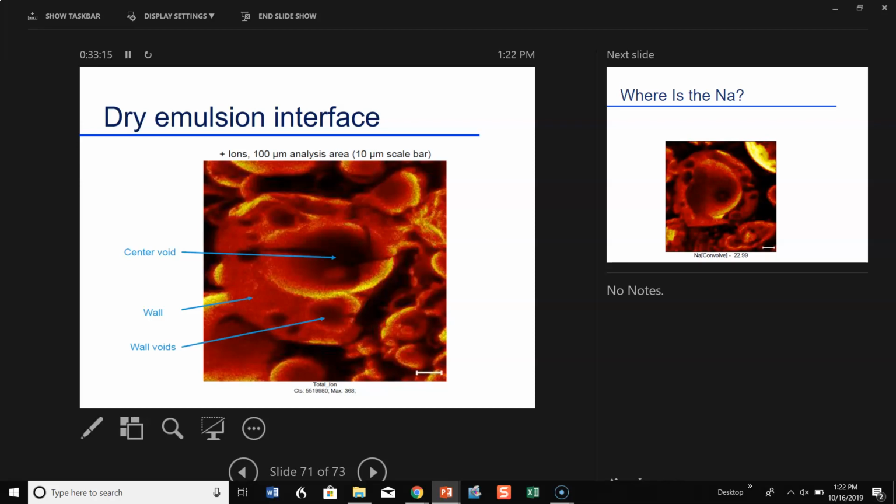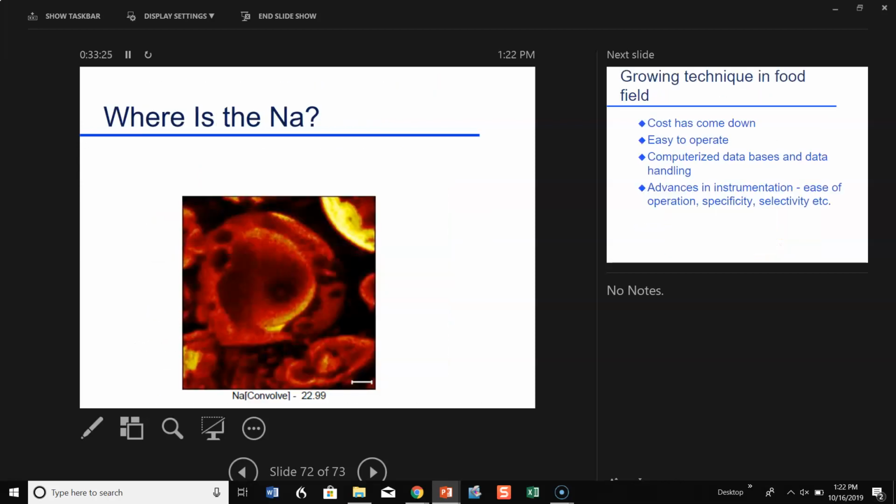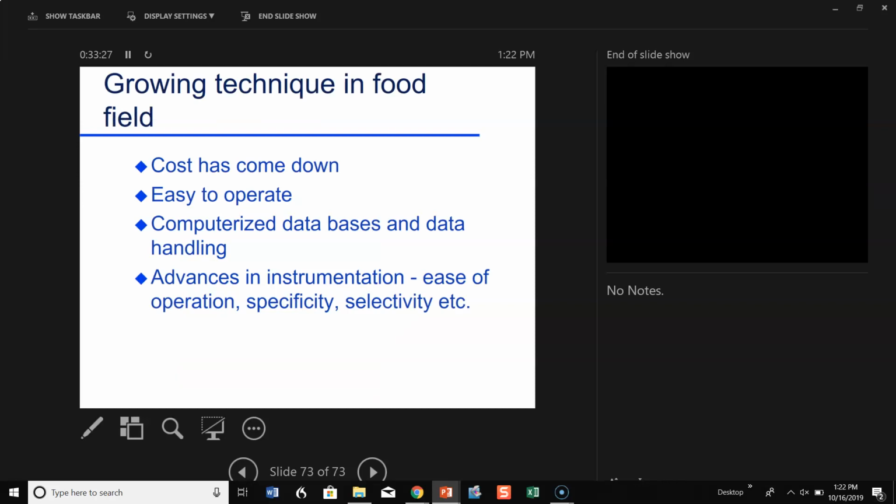So you can take an image of a particle as small as 30 microns and look how that particle changes, different structures of that particle. It's really a fascinating technique, like I say, to be using it to take images, kind of chemical images. And certainly, mass spectrometry is a growing tool in the industry and academic life as well.